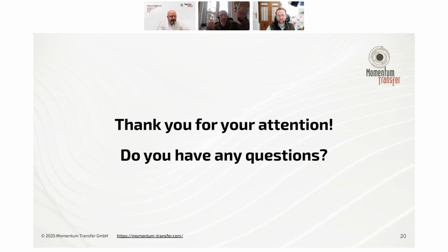Currently, we do not provide the option to fit and remove the baseline like that. In many cases we found that our algorithm still works pretty well, even with significant diffuse scattering. But if you find it's not working well, you would need to remove the baseline before loading the data into the program.